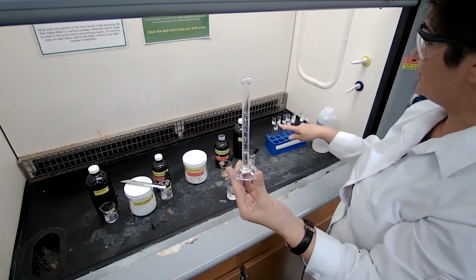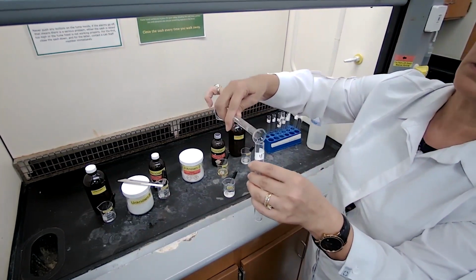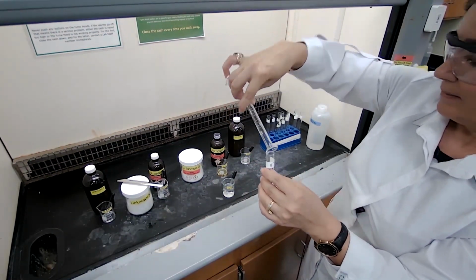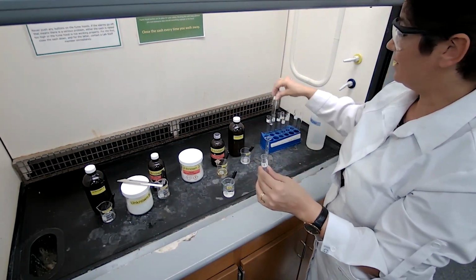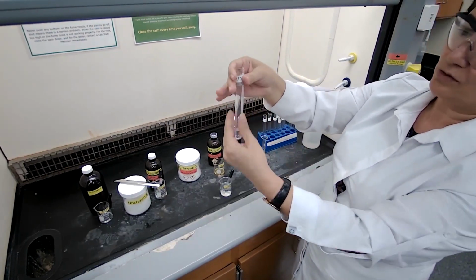For the first test tube, I'm adding 3 milliliters of water using a graduated cylinder. Now, to get 3 milliliters into the second test tube, I have 2 ways to do it, just showing different shortcuts.